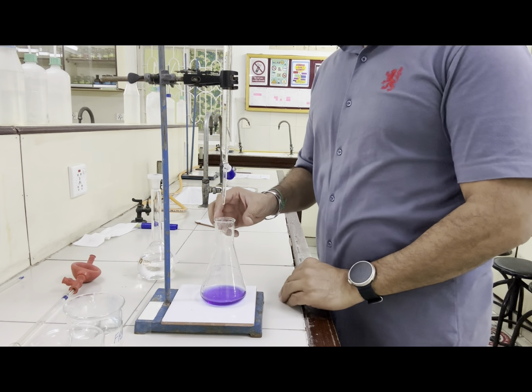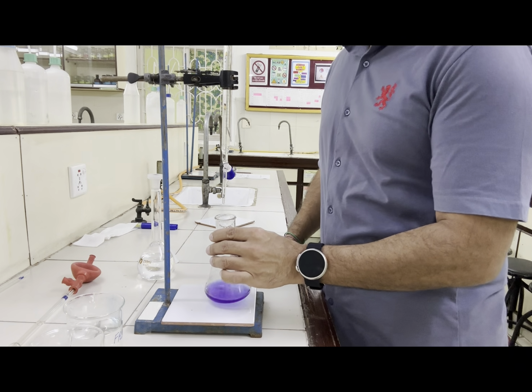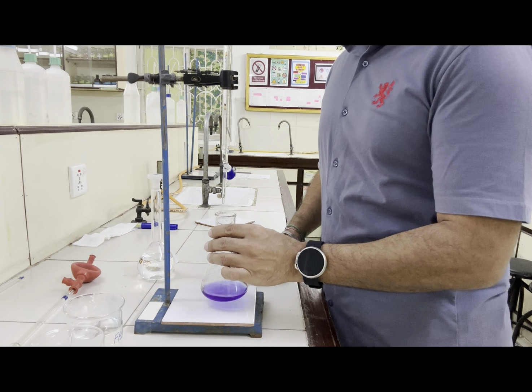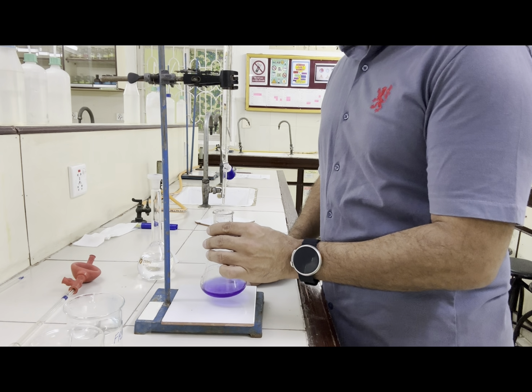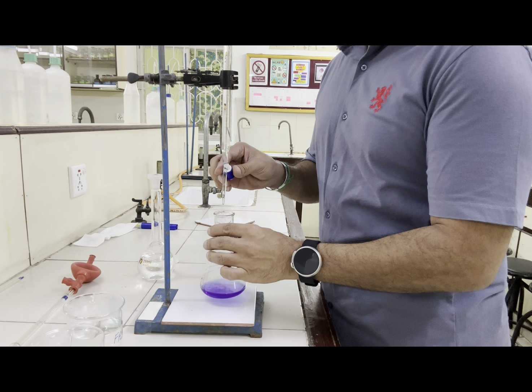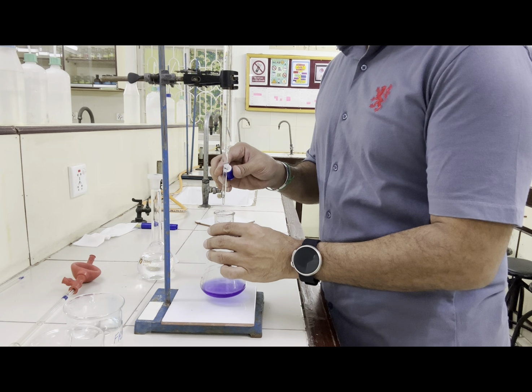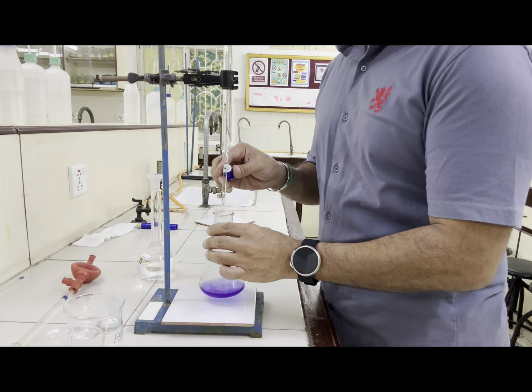Let's continue our accurate titration, but what is meant by the term accurate titration? It means when you are near the end point, like the previous rough titer result, you will slow down the volume addition from the Burette to dropwise, so that as soon as the color changes, you will stop the solution from the Burette.